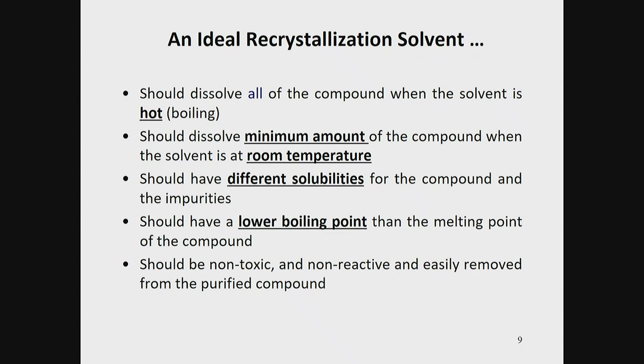So again, the ideal recrystallization solvent should dissolve all of the compound when the solvent is hot or boiling, okay? It should dissolve the minimum amount of compound when the solvent is at room temperature, so that would be considered cool. And it should have different solubilities for the compound and the impurities. That's the most important part.